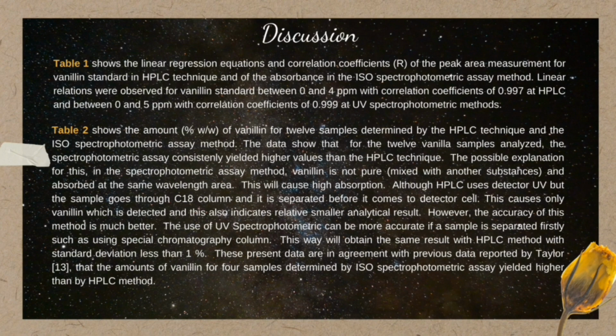Table 2 shows the amount percentage W/W of vanillin for 12 samples determined by the HPLC technique and the ISO spectrophotometric assay method.